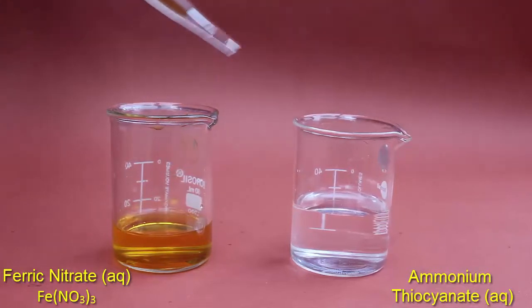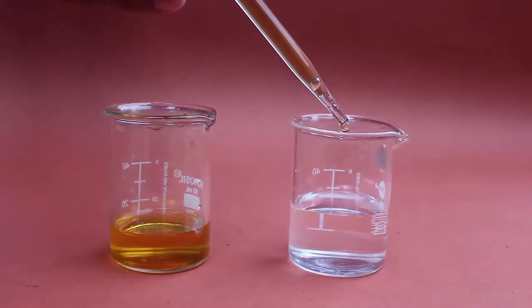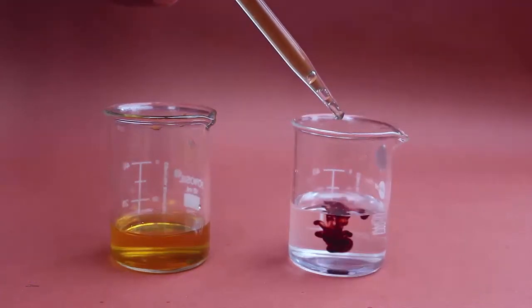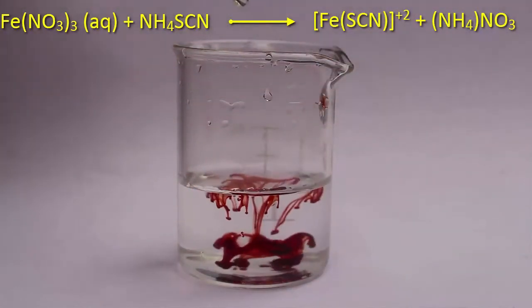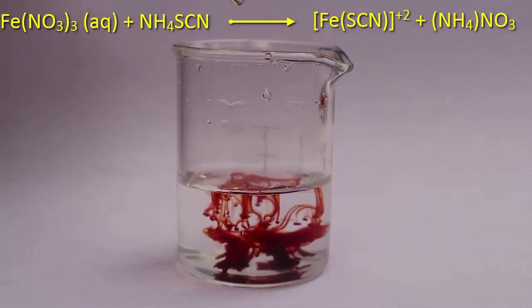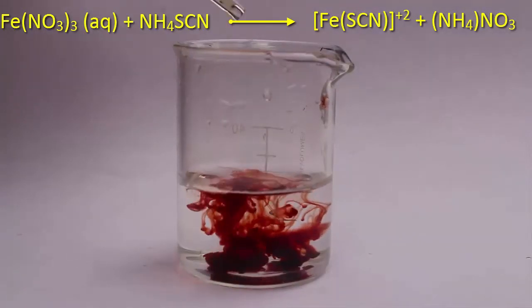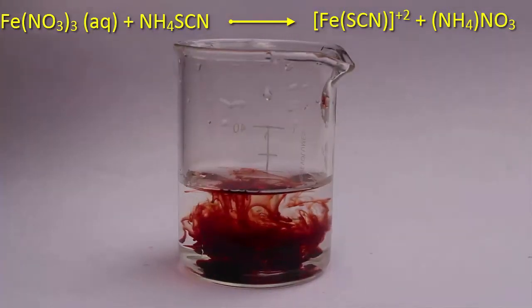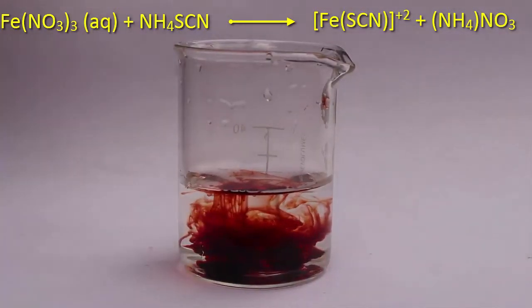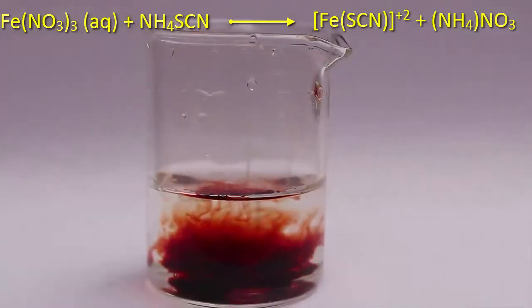Now add a few drops of ferric nitrate into the solution of ammonium thiocyanate. Suddenly you will see a blood red color. As you add more ferric nitrate the color will spread, and on stirring the mixture its color will be dark red — very much like the color of our own blood.